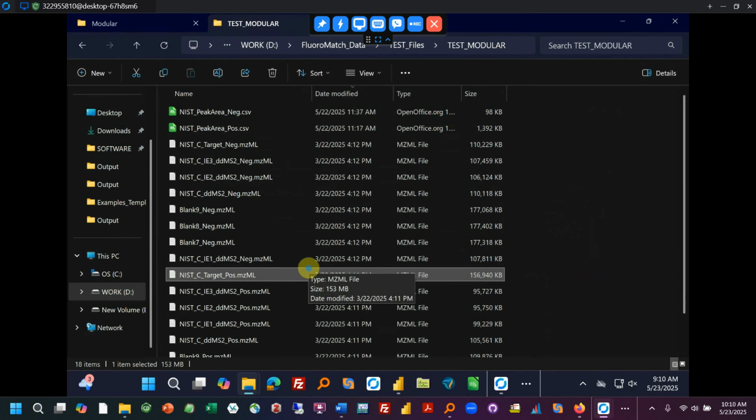Hi, my name is Jeremy, Associate Research Faculty at Yale University, CEO of Innovative Omics. And today we're going to be discussing how to run FluoroMatch, PolyMatch, LipidMatch modular. So the modular version of our software platforms.